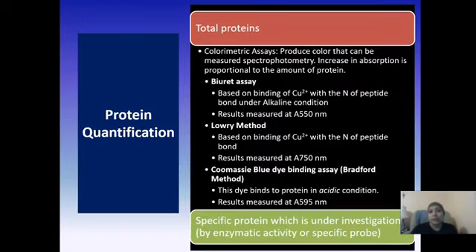Now, once you've created those dilutions, you can utilize many different types of methods to look for amounts of proteins in there and create relationships. Each one of those methods is going to give you different types of relationships, right? Not every one is going to be a purely linear standard curve. So for pure protein samples, without using any additions, you can still look at their absorbance at 280 nanometer wavelength, which is going to look at the amino acid content in your sample, and use that to create a relationship as well.